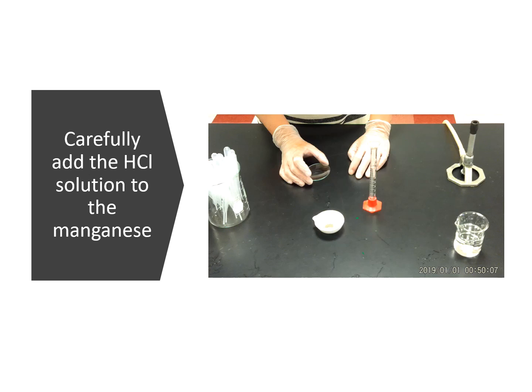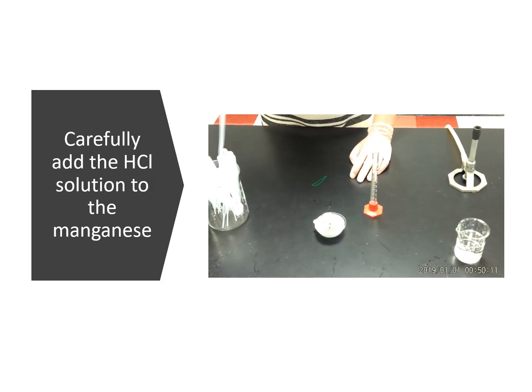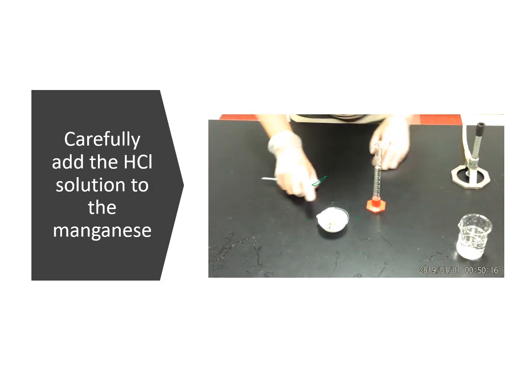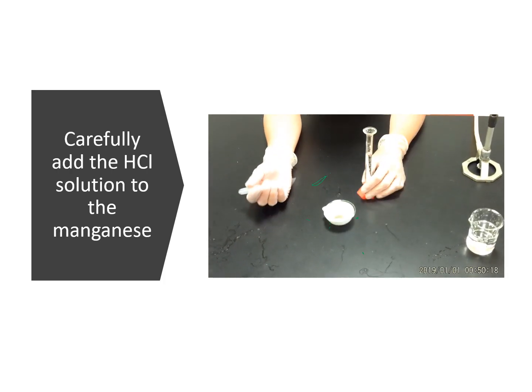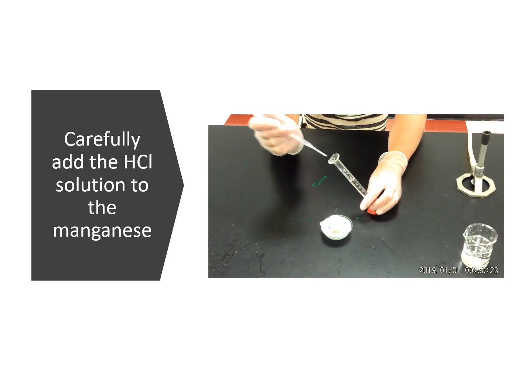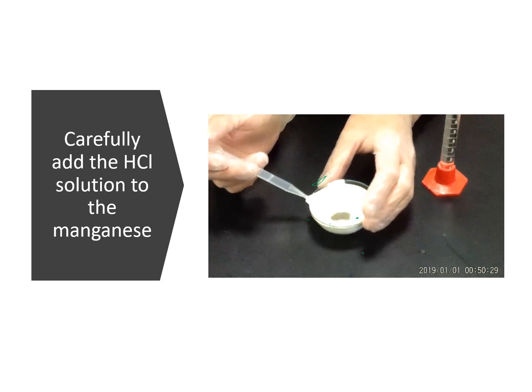You have basically your watch glass, and so it's going to go concave side down over your solution of manganese, and then you're going to add in your hydrochloric acid. So to add the hydrochloric acid to the manganese, first you're going to put your small watch glass over the crucible, and then you're going to just add dropwise your hydrochloric acid through the spout.